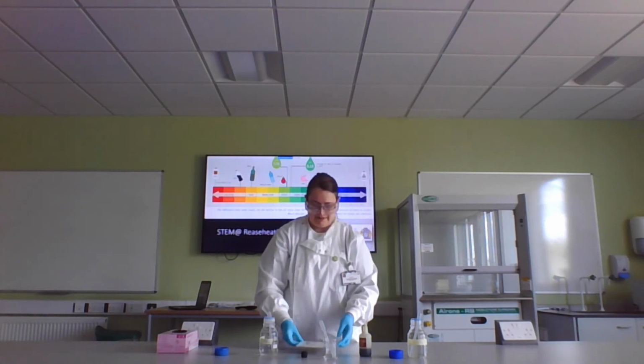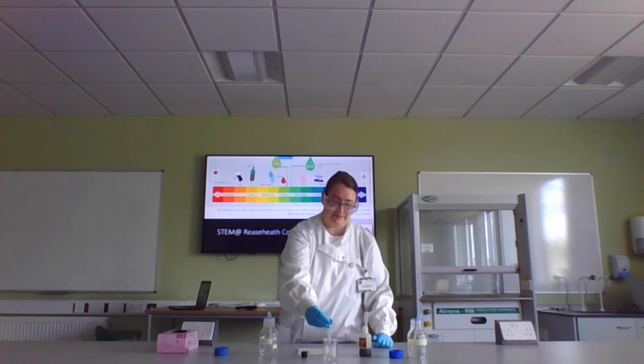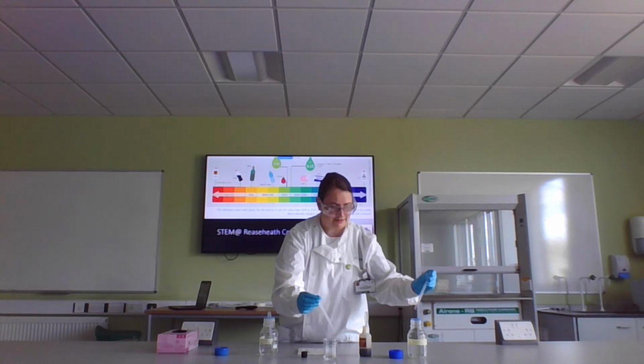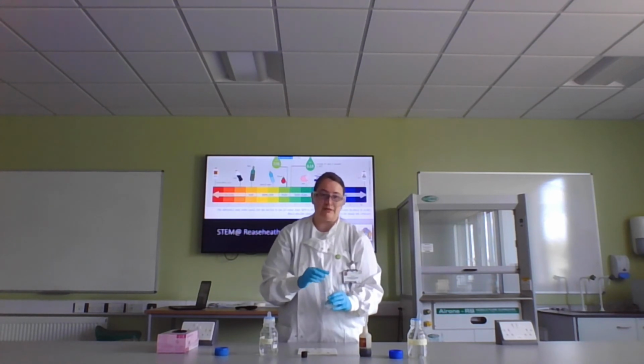So there, it's a greeny bluey colour. So if anything, I've put a bit too much alkaline in there. That means I need a teeny weeny little bit of hydrochloric acid. I'm going to say just a tiny dribble like that. What you find is this scale is very, very sensitive when you get close to 7.